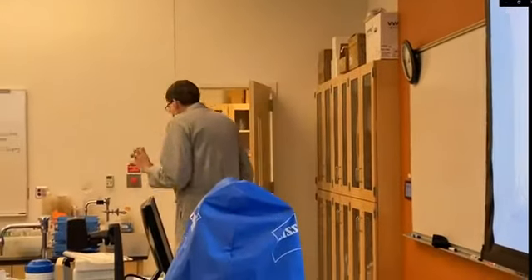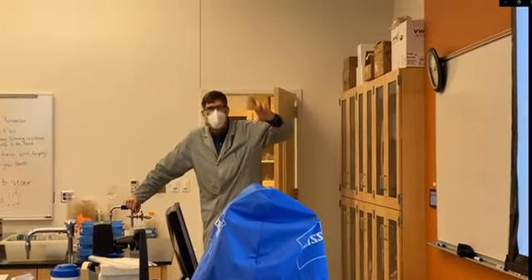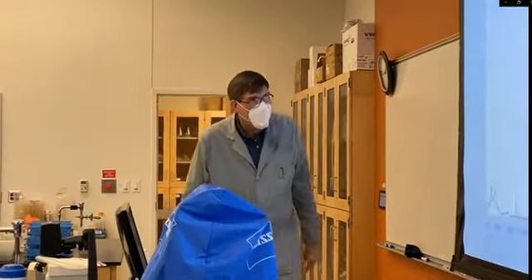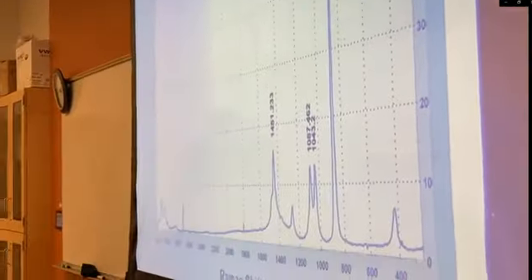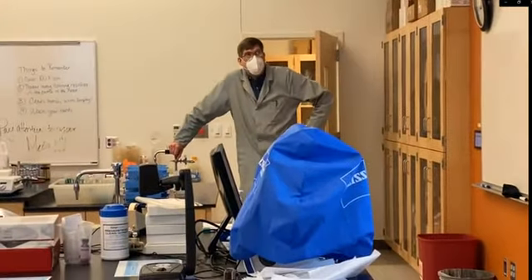And so, as we do with other kinds of spectroscopy, we typically will take the measurement where we get the strongest signal. So today, when you measure your standards and sample, we're going to record the intensity here at 875 nanometers, or excuse me, 875 wave numbers. Our x-axis is in wave numbers.